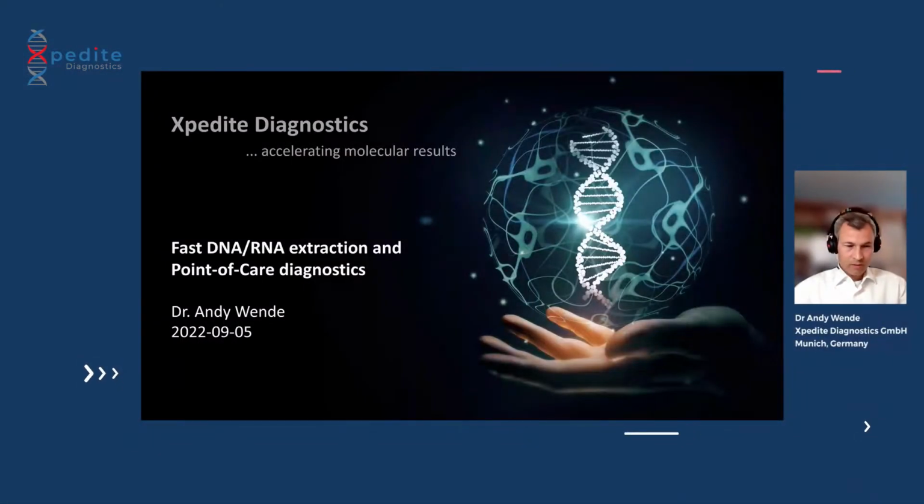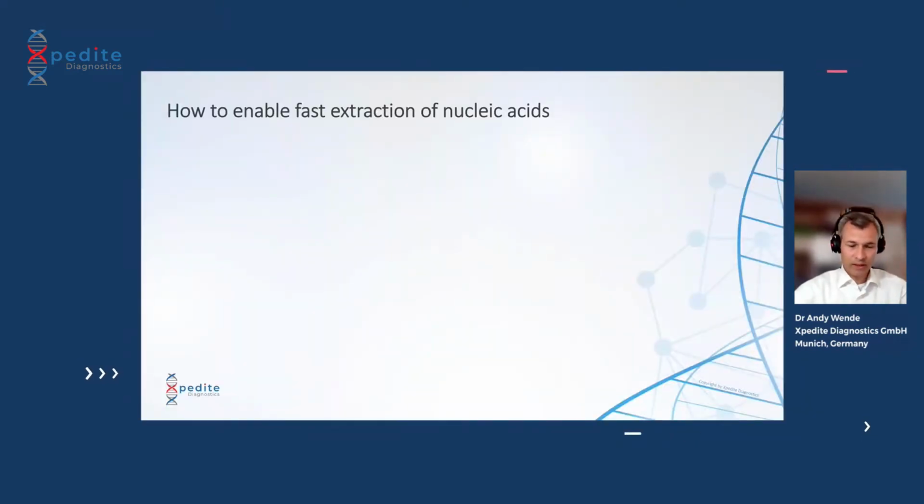Welcome back to the second session of today's webinar. In this second session, I will focus a little more on fast DNA RNA extraction itself and the use in point-of-care diagnostics. And we'll talk about what this point-of-care diagnostics is in itself.